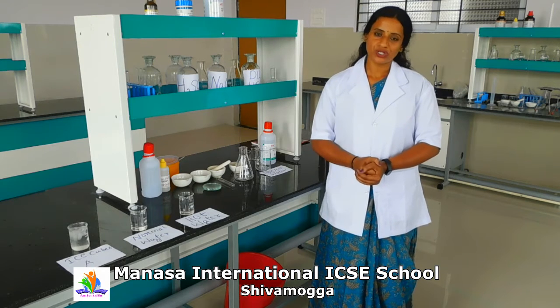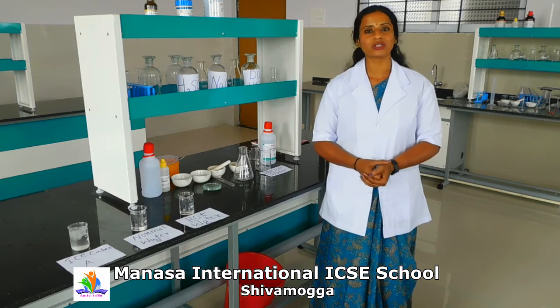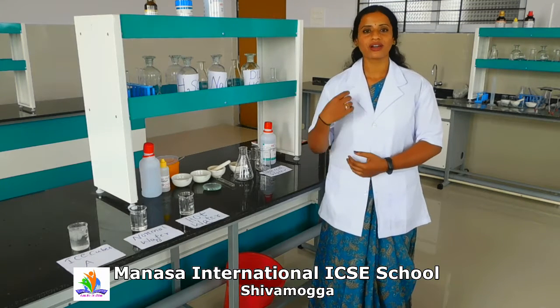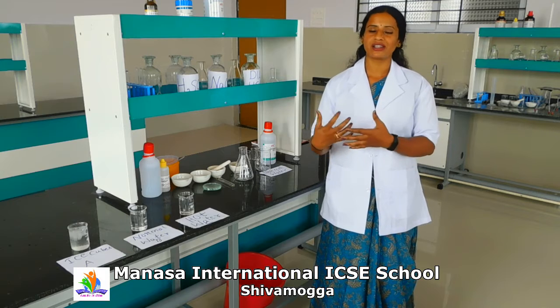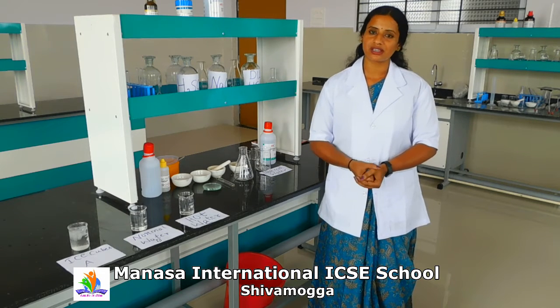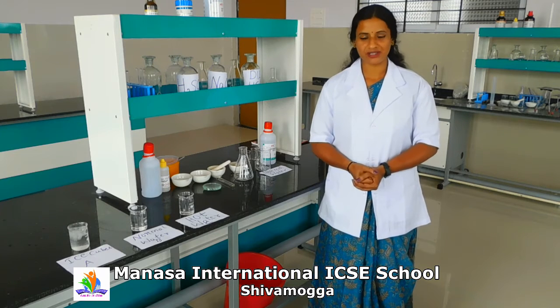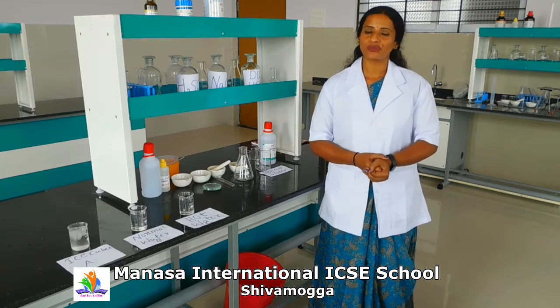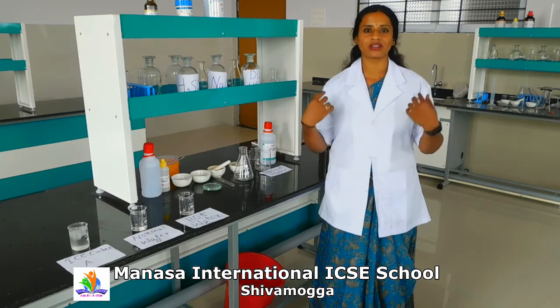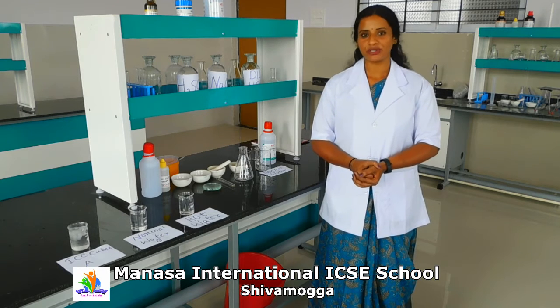So first and foremost, when you enter the chemistry laboratory, you must be very alert and follow the instructions given by the teacher. It is mandatory to wear the apron. Why? Because we will be handling different dilute and concentrated acids, bases, alkalis and different solutions. They are purely chemicals. There might be chances of some dangerous reactions. So that is the precaution. We wear this apron while conducting any of the experiments in the chemistry laboratory.